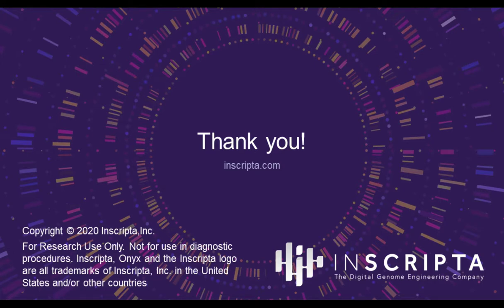So thanks, Christy. That's a great question. We are quite certain that the edits are made, but of course you cannot be 100% sure because, as I said in the presentation, the barcode stays on the plasmid. We don't want the barcodes on the genome. So we recommend to actually reconfirm that you have that genomic edit, especially if you have some interesting strains that you are looking for.